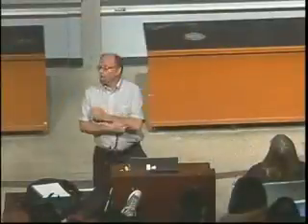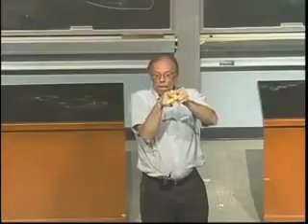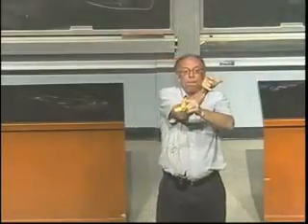So that's one exercise. The other exercise to help you understand optical section is we're going to have a slide like this. This is a hollow piece of glass, and this is solid. Now, this can sometimes be confusing. But since we can optically section these specimens, if I had 2 pieces like this, and this one's hollow, and this one's solid, if I'm in the middle of this optical section, I would see an edge here, right next to another edge, and then what would be in the middle if it was hollow? Nothing. Air, right? So I'd see a space, and then I'd see another edge. But if I was in a solid, I would see edge, solid, edge. I would never see 2 lines.